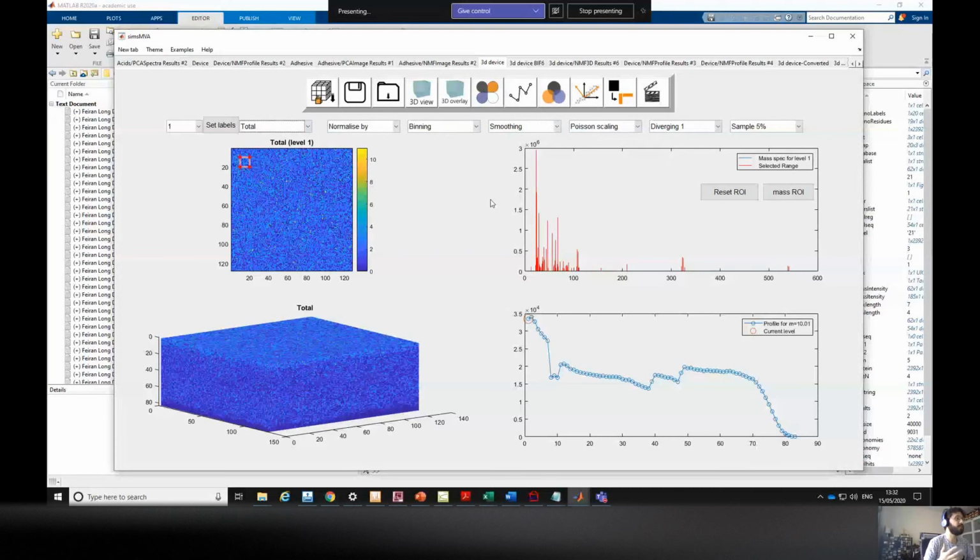But because it's 3D, it takes a bit longer to do each processing. So you saw that just now, because it had this level 3 of smoothing. It's a function that takes into account pixels and also levels, so it takes a few seconds to process. Be careful, if it's too large, you may have to wait for each of those things you do. I may in the future add a button to process so that, if it's too large, you don't have to wait every time.